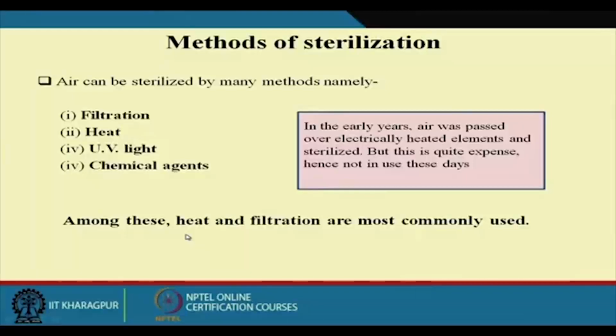So in this lecture, mostly I shall concentrate on the contaminants present in the moving air, because heat is no good for the sterilization of the air. Filtration is a kind of physical separation process through which we can separate the particulate matter or cells present in the air.